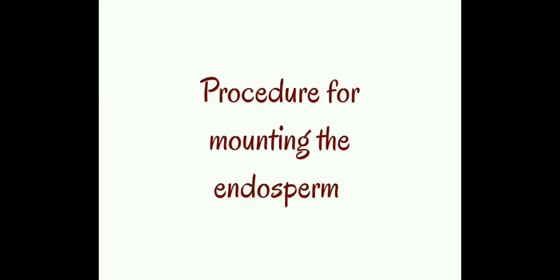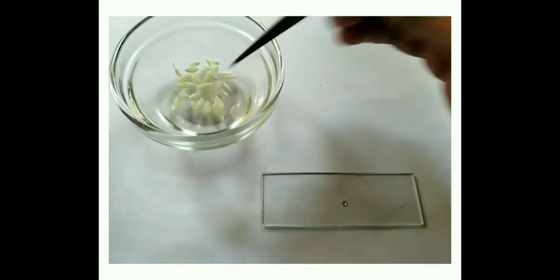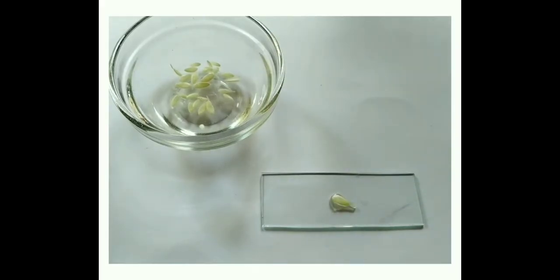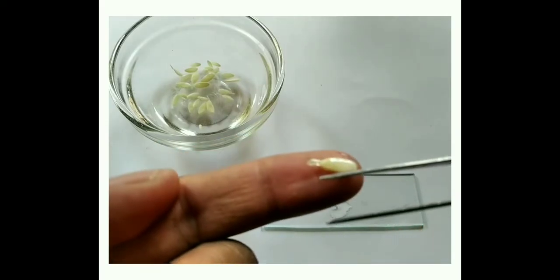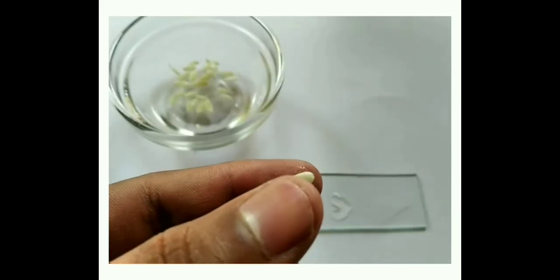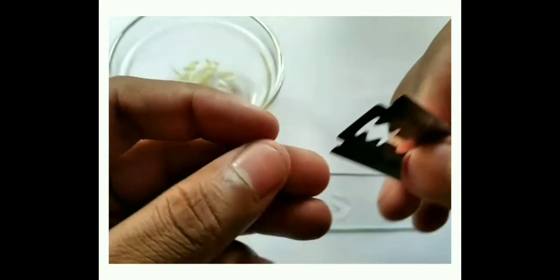Procedure for mounting the endosperm: take a clean glass slide and the seeds. Seeds are blotted with blotting paper in order to remove the mucus from the outer covering. Take the seed, hold it tightly, and cut the edges of the seed with the help of a razor blade.